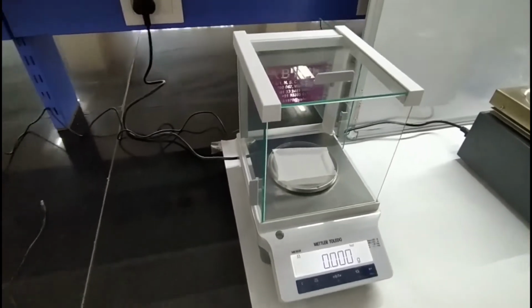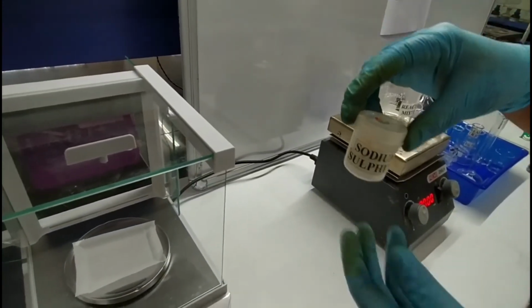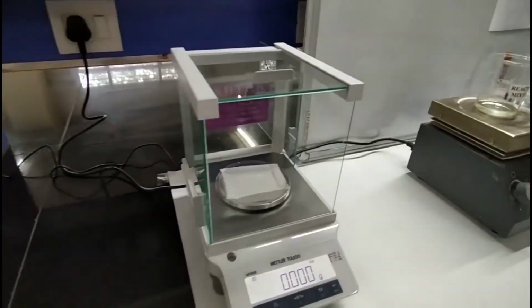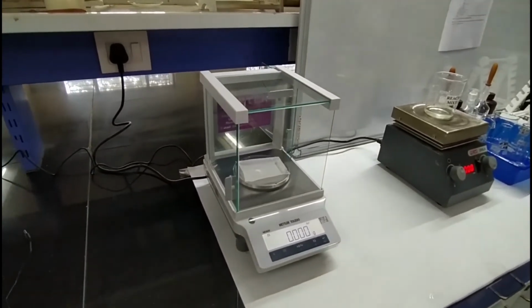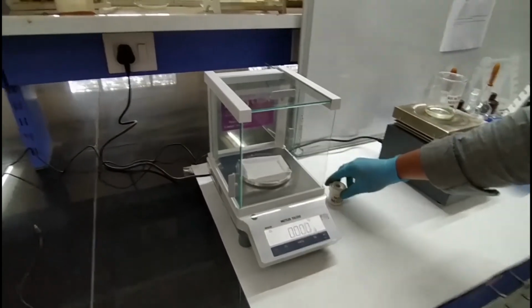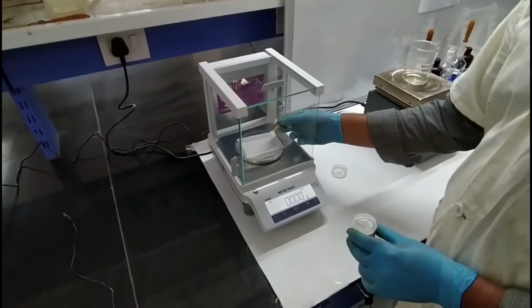Here is the sodium sulfide. This I am going to transfer over there. 200 milligram means 0.2 grams.